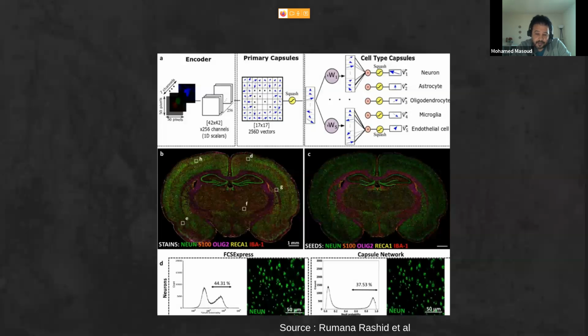So this part comes from the thresholding part. As we said, there is an overlap between the true positive and true negative. But for the high scored true positives, they use this part for training this network in the beginning.